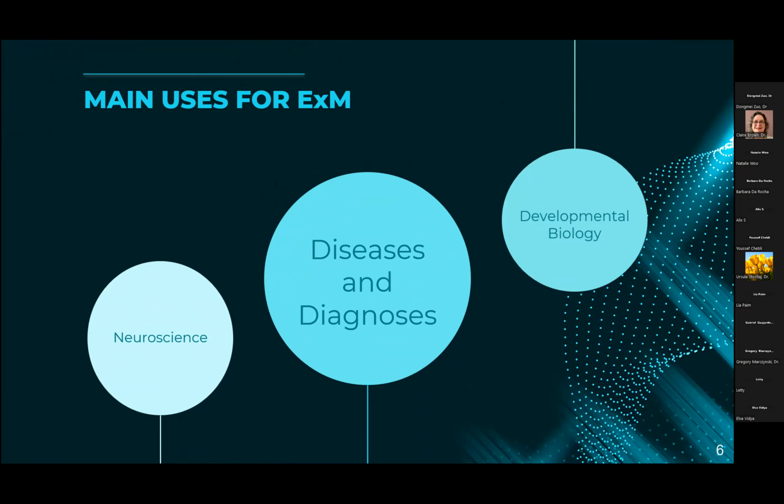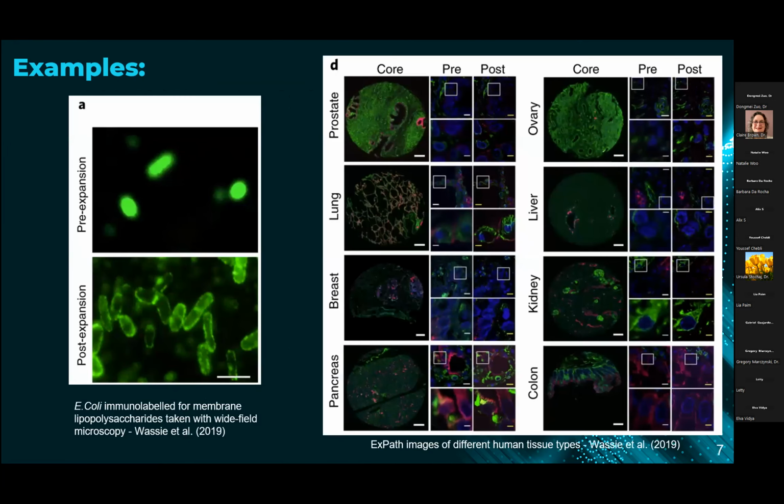And so personally, I'm interested in studying brain tissue, so in mouse models. And for my project, I want to look at the vasculature and at how these mouse models that have brain metastasis and how these cancer cells spread. Yeah, pretty much that's it. And then here are some examples. These are not what I've done, but what I've read other people have done. So I thought it might be of interest to you guys.